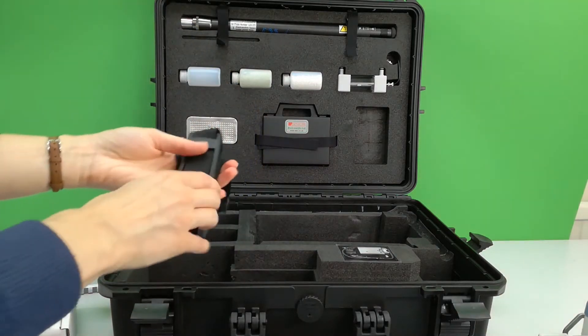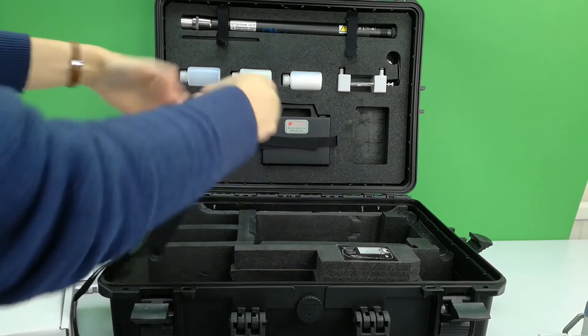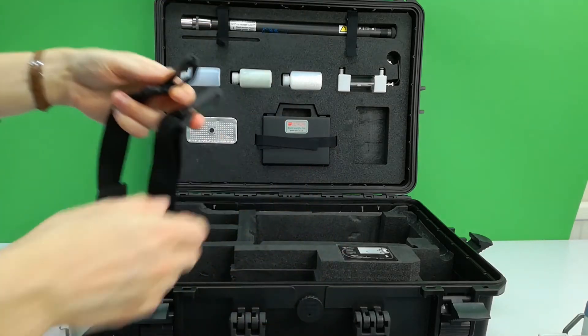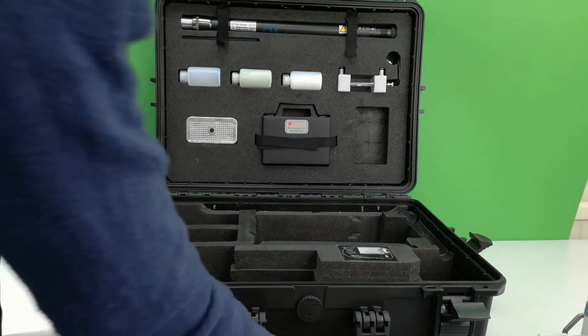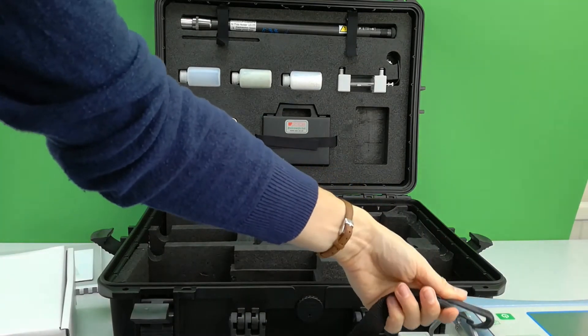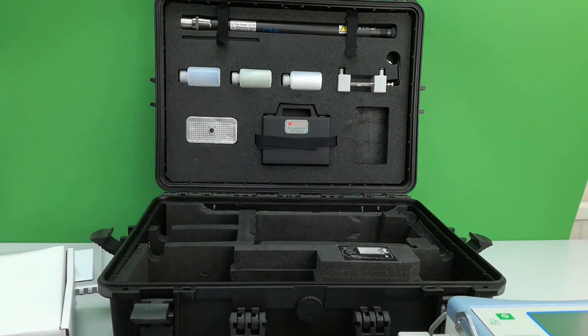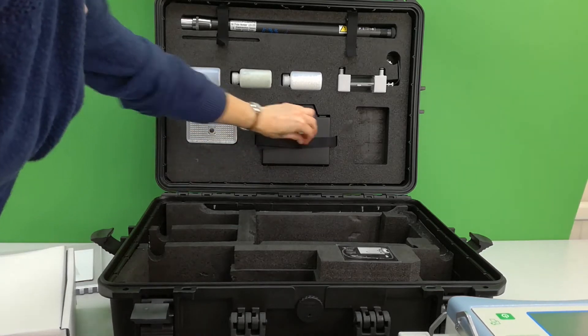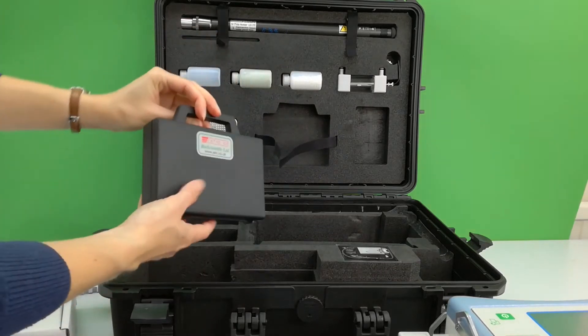For comfort while carrying, a strap is supplied which clips either to the top of the console or the side, giving you the option to wear it either around your waist or shoulders.